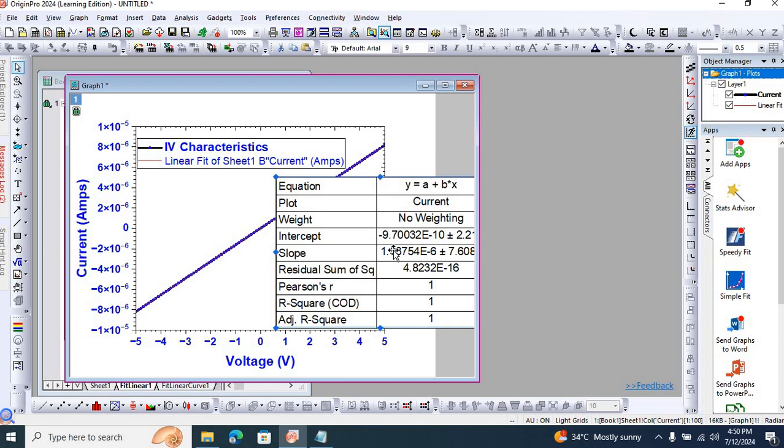Now this is an undoped gallium nitride sample, and definitely we are expecting it to be semi-insulating. It's a highly crystalline sample grown with metal modulated epitaxy, an advanced version of molecular beam epitaxy, at Georgia Institute of Technology in Professor William Allen Doolittle's group. The name of the group is Advanced Semiconductor Technology Facility. So definitely expect high quality samples from that group. If it is an unintentionally doped sample, then you should definitely expect high resistivity from this sample and low carrier concentration.